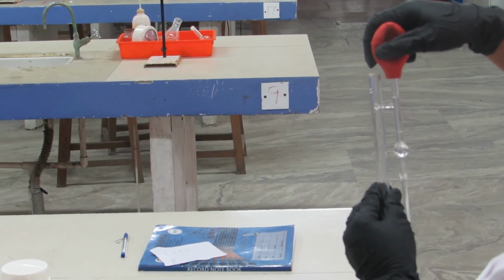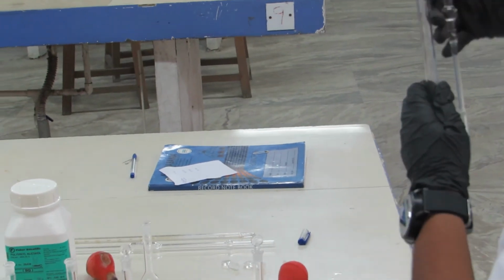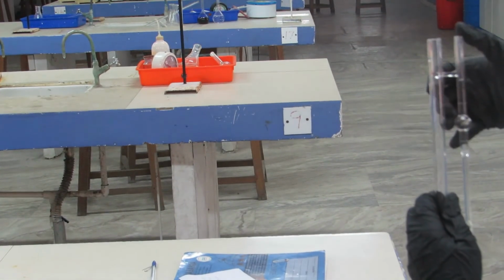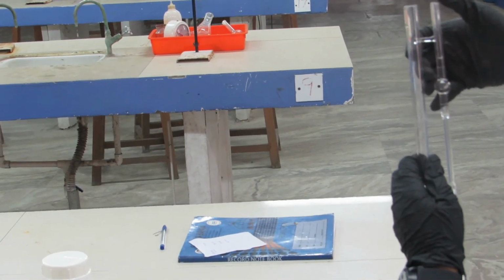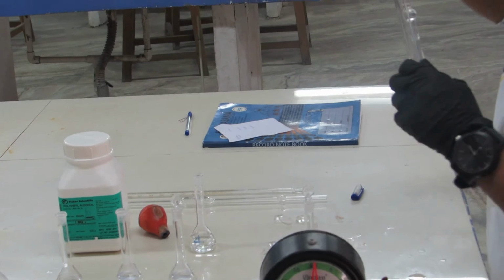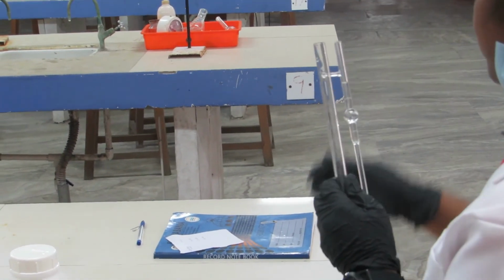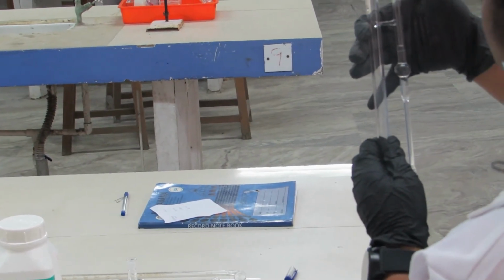See, again, we are measuring the flow time for this concentration, for 1% PVA solution, yes.